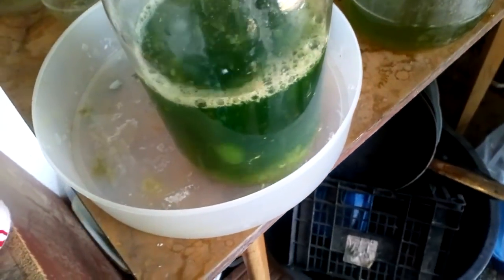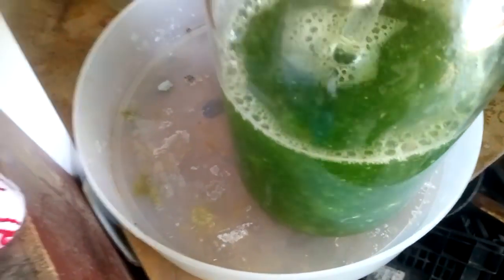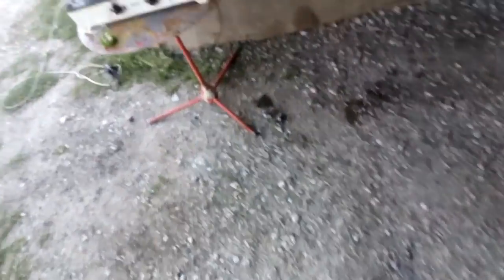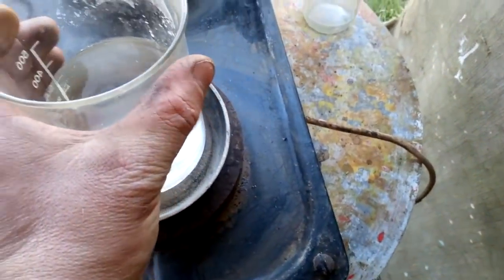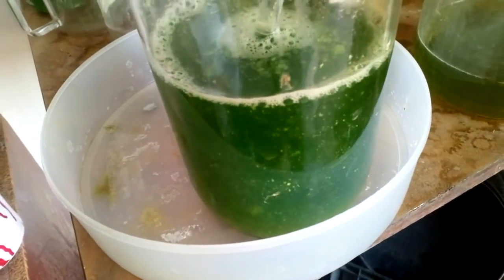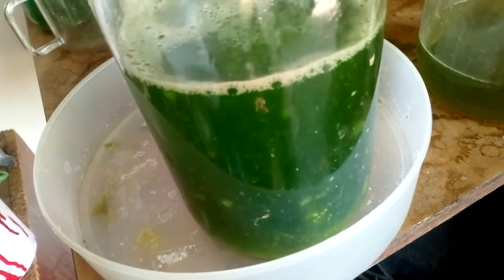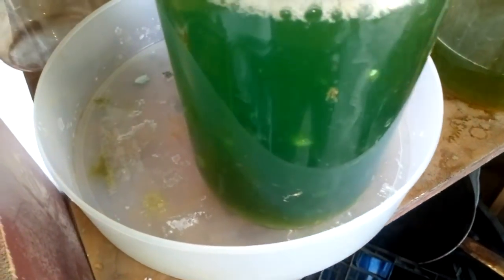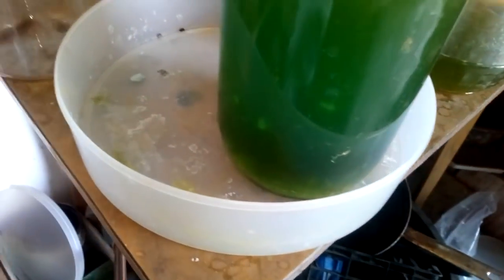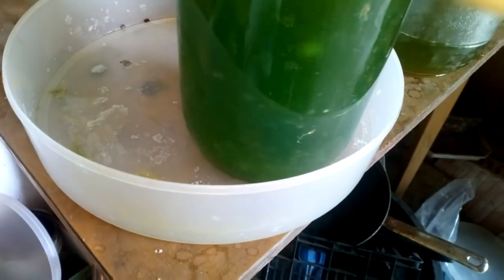Okay guys, we add some water to easily dissolve all this urea because I added too much urea, but never mind. Here we got SMB dissolved in water, and now we're going to drop some gold. It's a lot of solution, but this is because of all that urea.